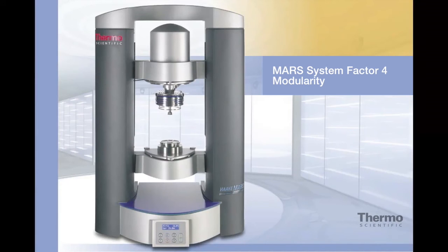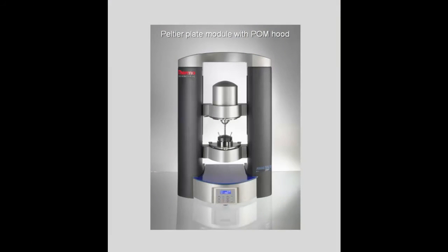Modularity. You work with low viscous polymer solutions or solid-like samples.